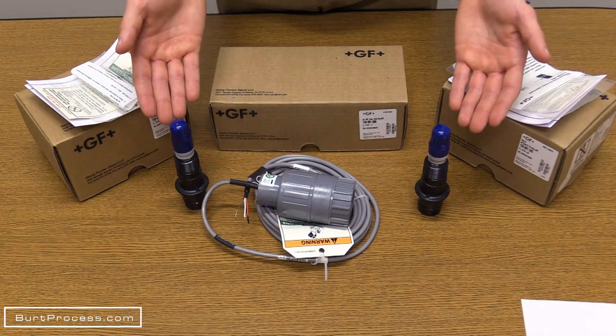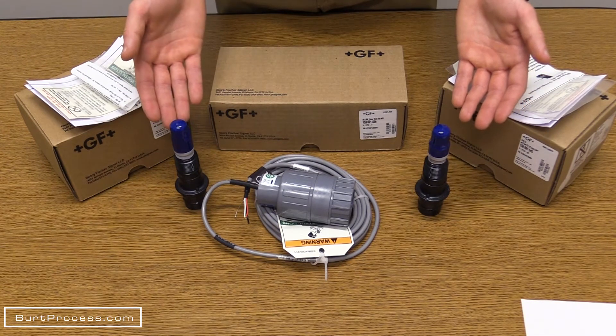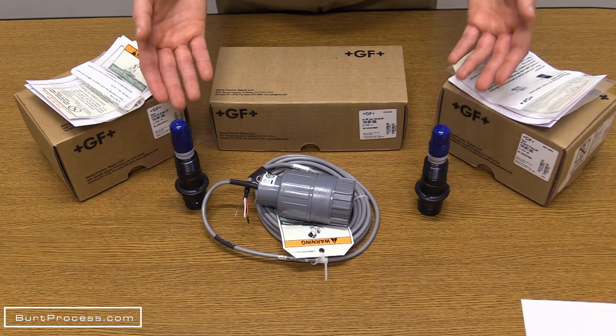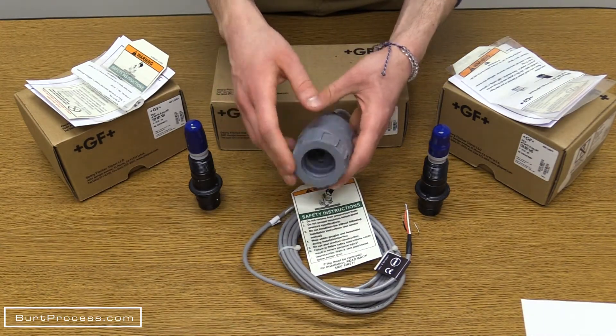In regards to the flat sensor versus the bulb sensor: primarily, the bulb sensor is used for submersible applications while the flat sensor is used in inline applications. However, generally it is personal preference.